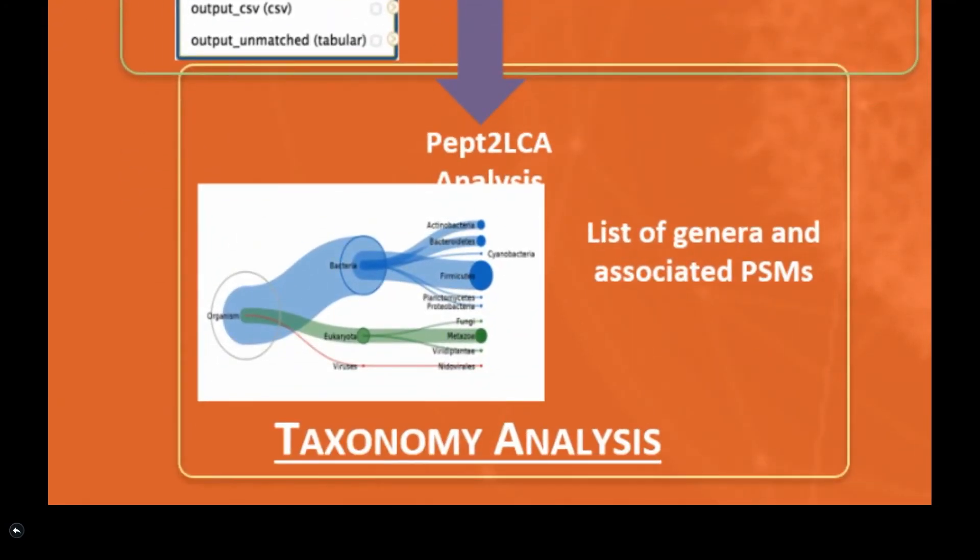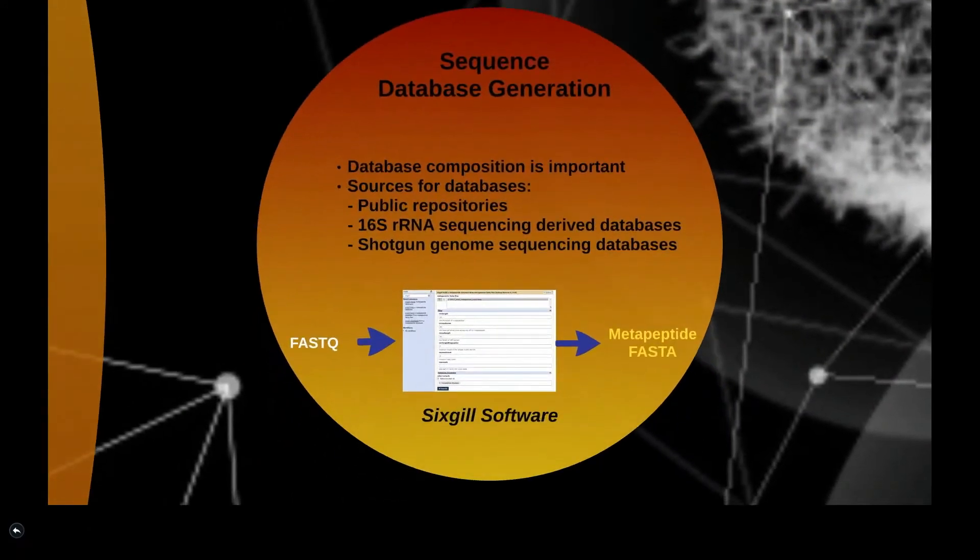Fourth, the identified microbial peptides can also be used for taxonomic analysis of the proteins present in the sample. Let's go through a step-by-step analysis of this workflow.